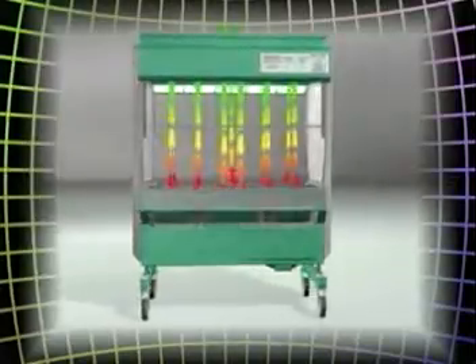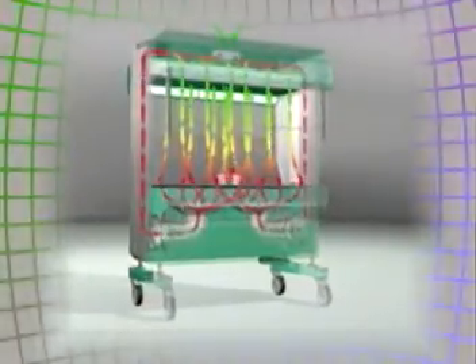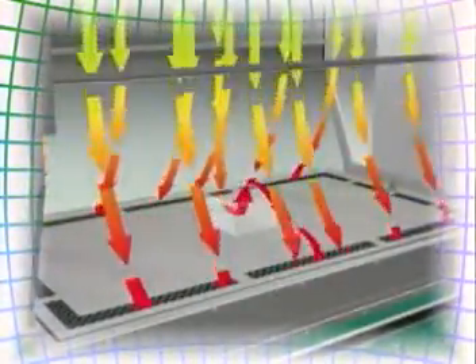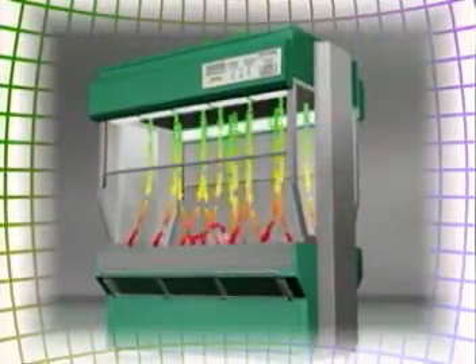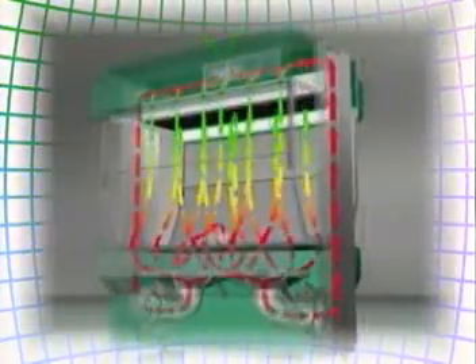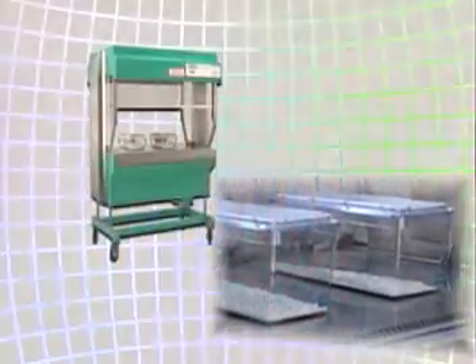HEPA filtered air flows down from the top of the workbench, pulling airborne particulate from the cages into the air intake around the perimeter of the work surface. This airflow reduces personnel exposure to particulate escaping from the cages and protects animals from becoming contaminated.